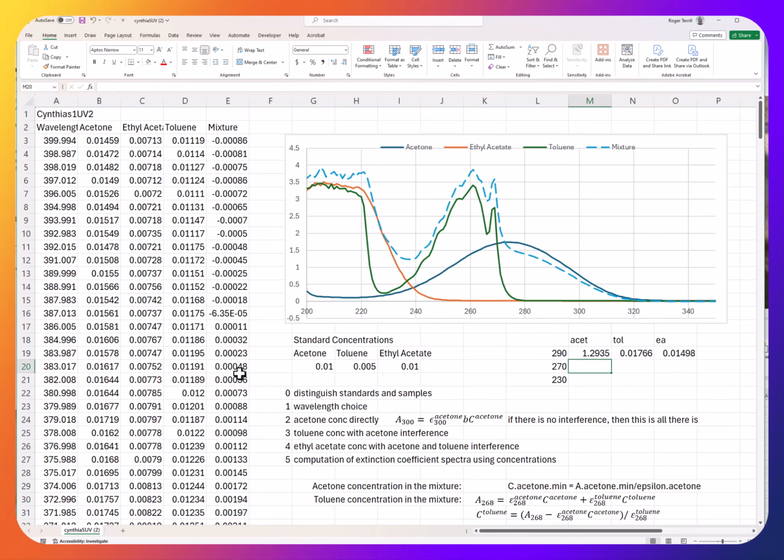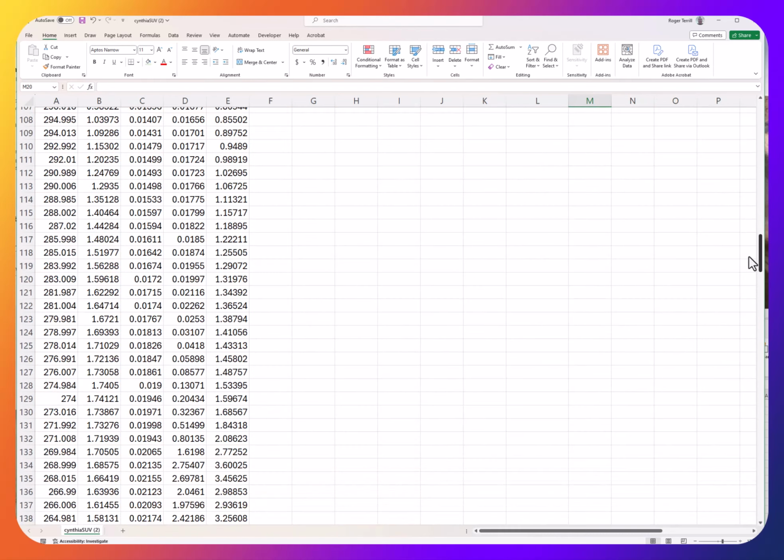Now to go to 270, that'll be a little bit farther down. 270 is going to be 133, right?